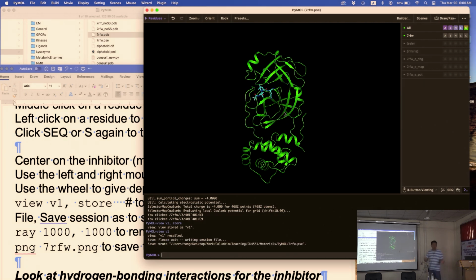So next time I open that file, that view 1 is in there as well. If you don't save it, it's lost. Okay, so keep that in mind. It'll happen once or twice, then you'll remember. Okay? Still good? All right, let's see what's next.